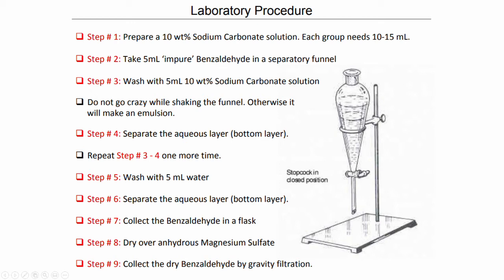However, there is a chance that we still have water, just H2O, in our organic layer. To remove this excess water, we dry it using magnesium sulfate.